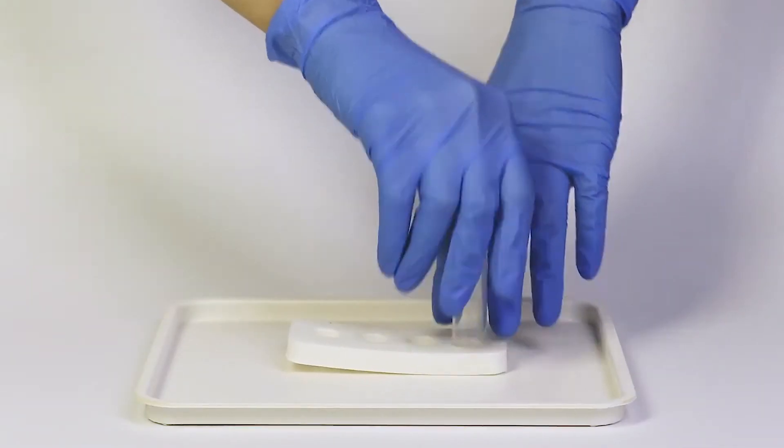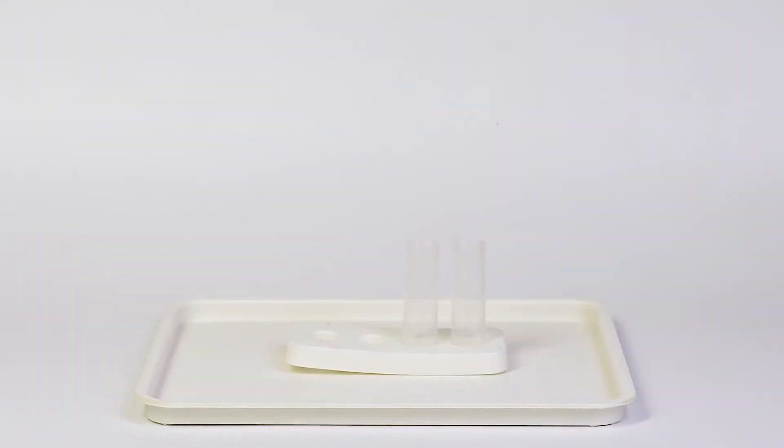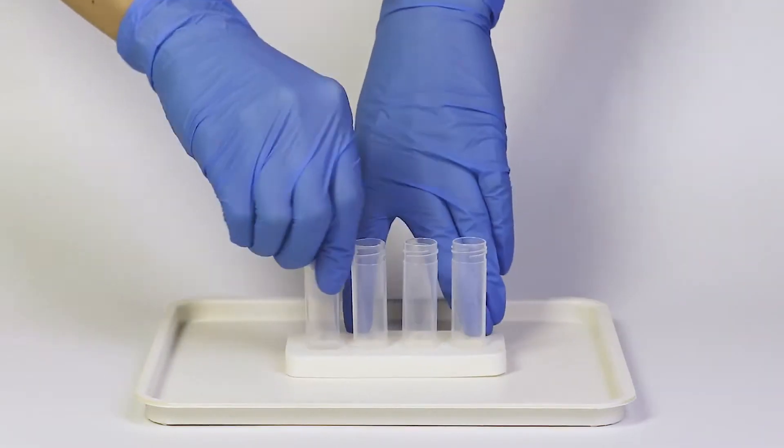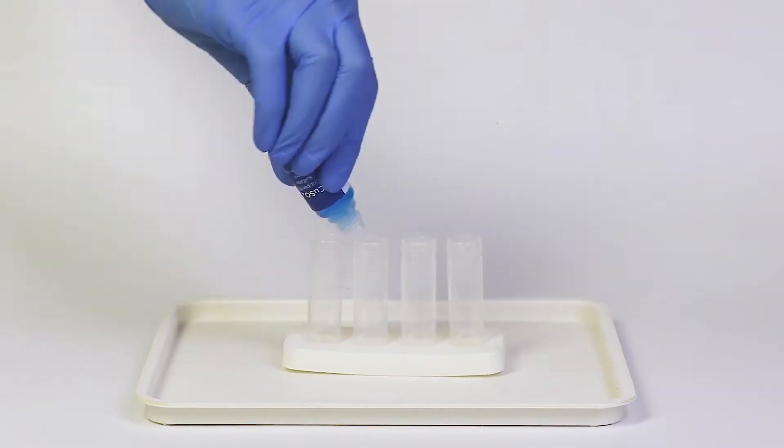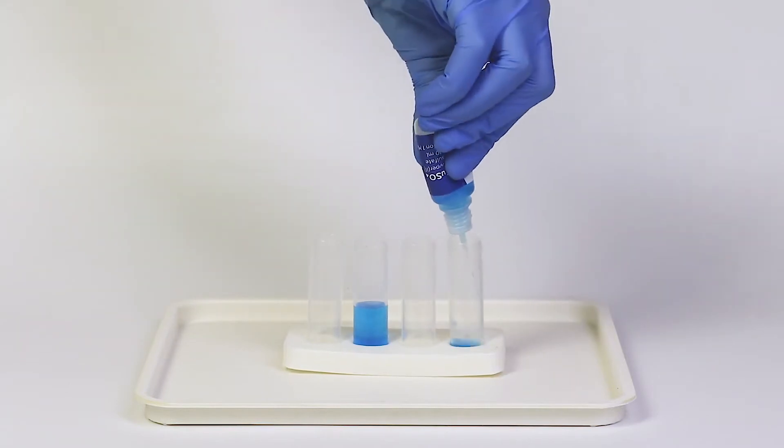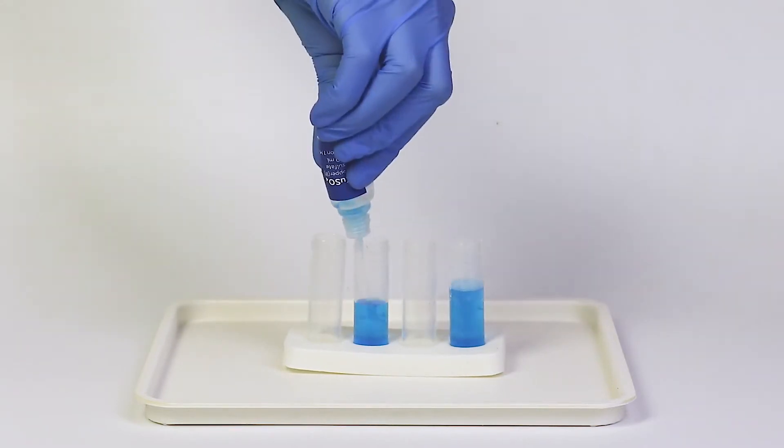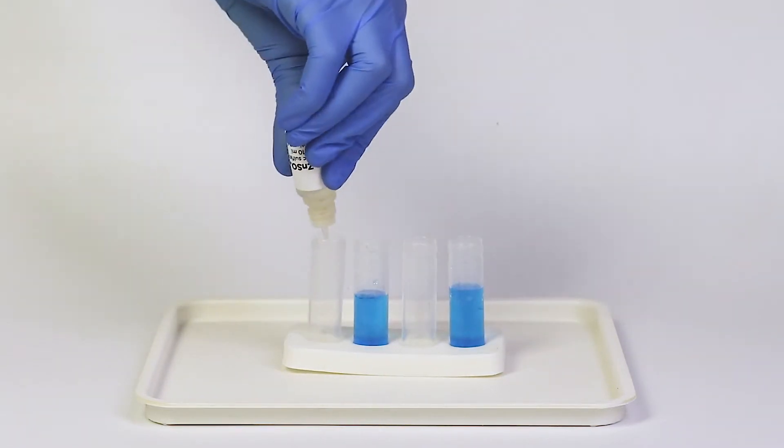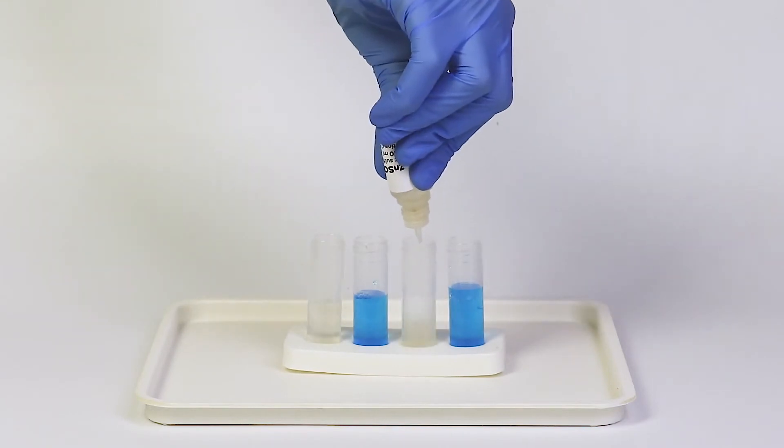Set all four vials into the holder. Pour half a bottle of copper sulfate into the second and fourth vials, and half a bottle of zinc sulfate into the first and third vials.